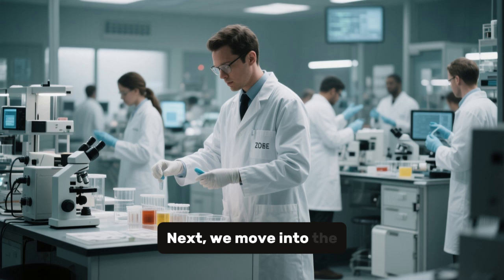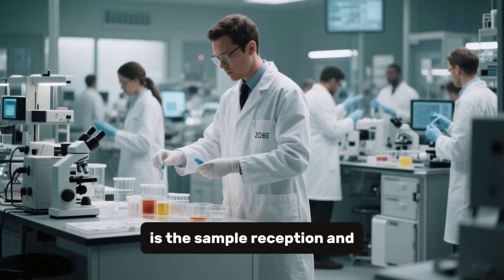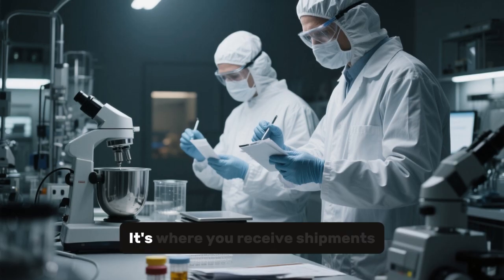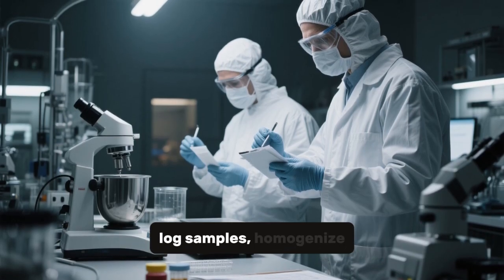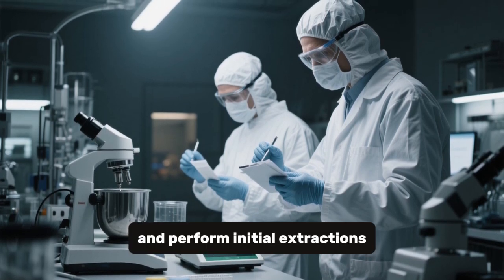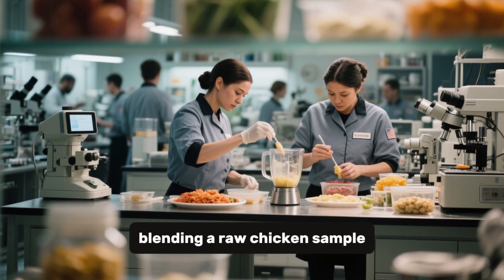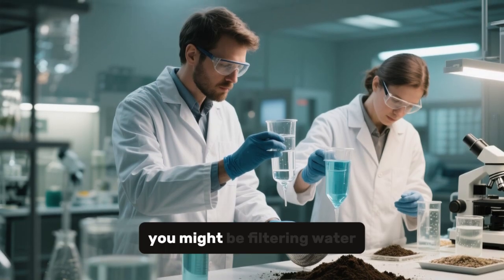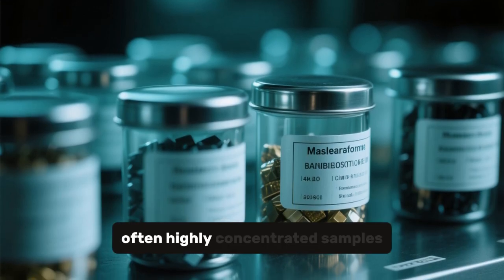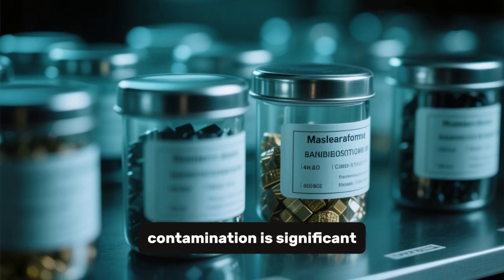Next, we move into the lab proper with Zone E2. This is the sample reception and preparation area. This zone is a hive of activity. It's where you receive shipments, log samples, homogenize, dilute, weigh, and perform initial extractions. For a food lab, this is where you'd be blending a raw chicken sample. In an environmental lab, you might be filtering water or sieving soil. Because you're handling raw, often highly concentrated samples, the potential for contamination is significant.